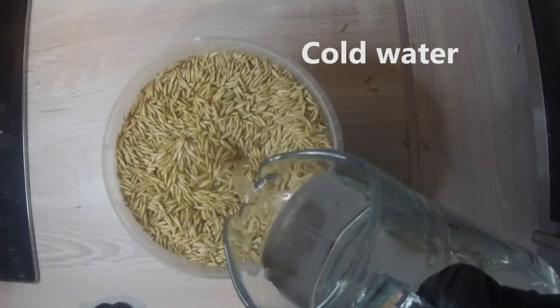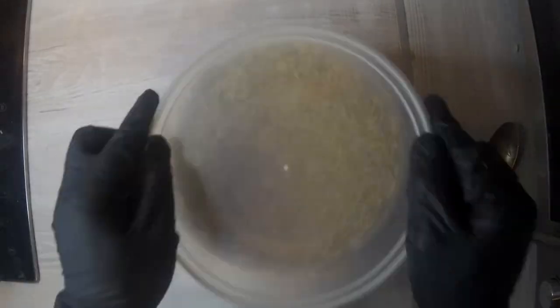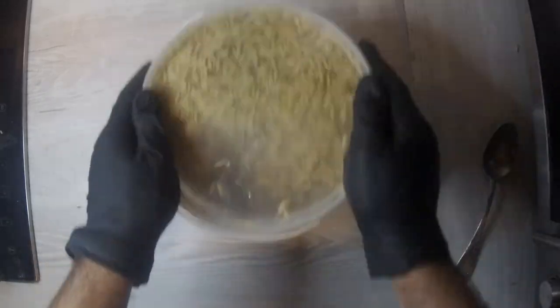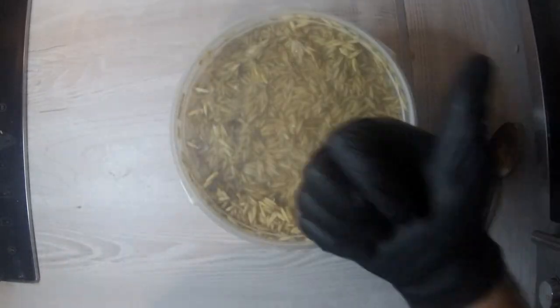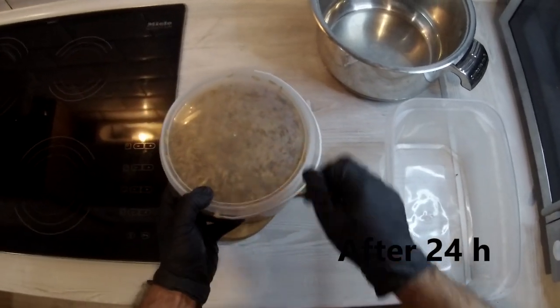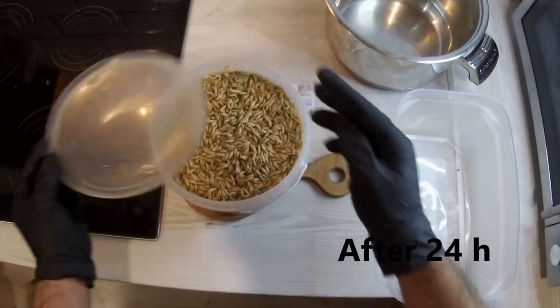After measuring the necessary amount of grain, add some cold water and let it soak for 24 hours. Remember that after preparation the volume will double, so you don't need to take more than necessary.